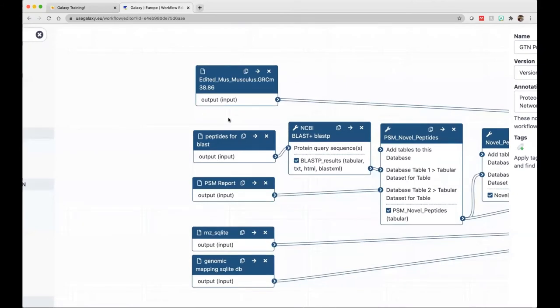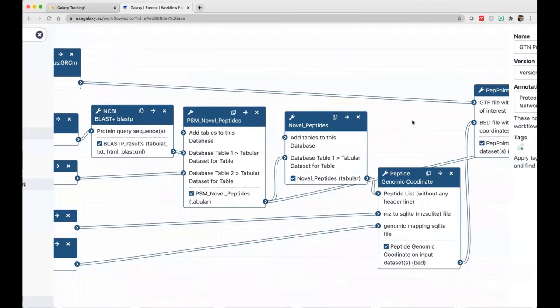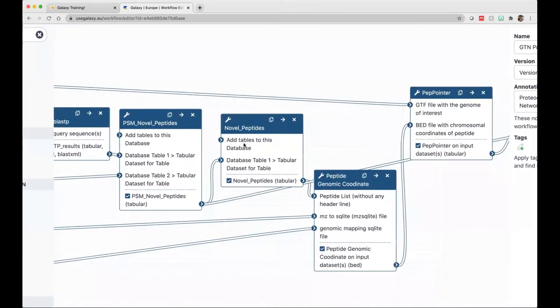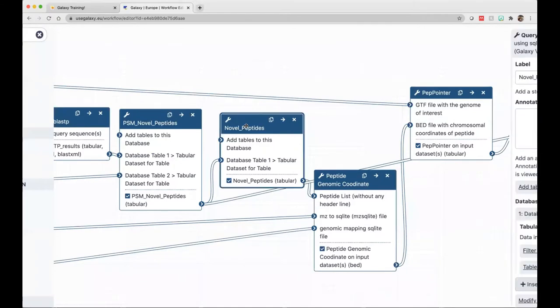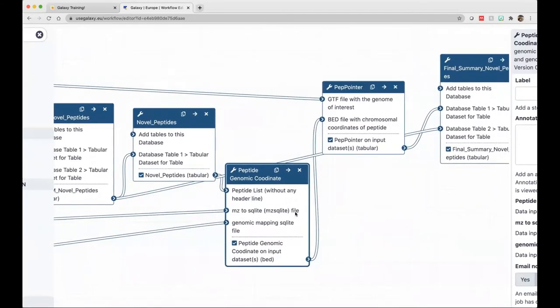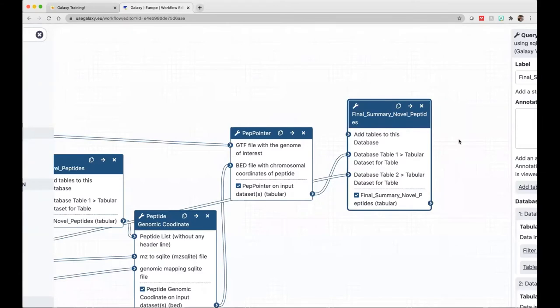Each and every tool involved in your workflow will be right here. The inputs are the Mus musculus GTF file, the peptides for BLAST-P, the PSM report, the mz2sqlite, and the genomic mapping file. The tools involved are NCBI BLAST-P, query tabular to extract novel peptides, PSM information, a novel peptide only file, the peptide genomic coordinate tool, the PepPointer tool, and the final summary query tabular output.